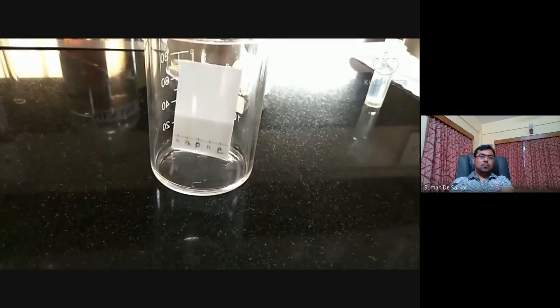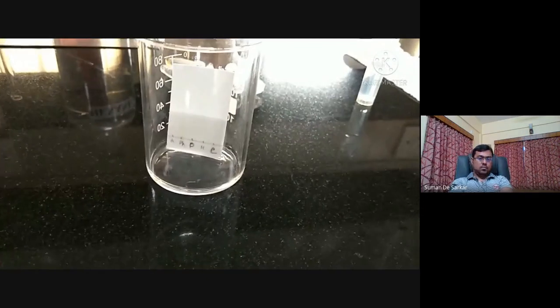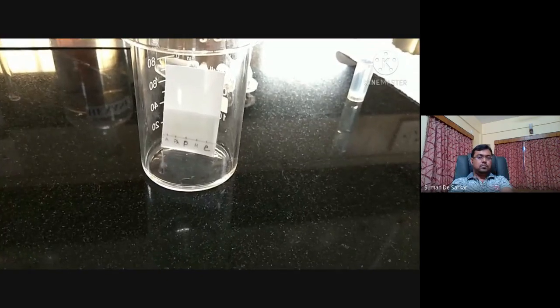We have made all the spots there, and the eluent should not reach this pencil mark, it should not go into the solution. Only through capillary action should the solution go up. You can see it is already moving up. Once the solution is moving up, it takes all these compounds, and depending on the polarity, some will move faster upward, some will move slower, so there should be some difference in the Rf value. We'll continue this TLC until the solution goes up to a certain level, and then take it out and see it in the UV chamber.